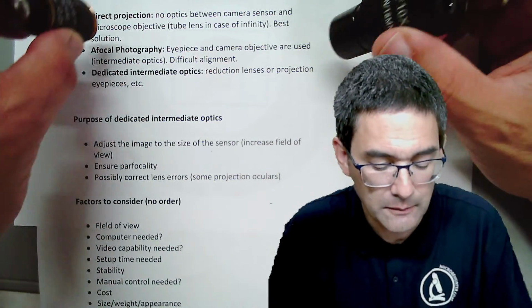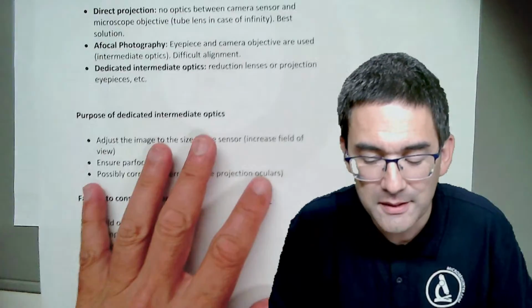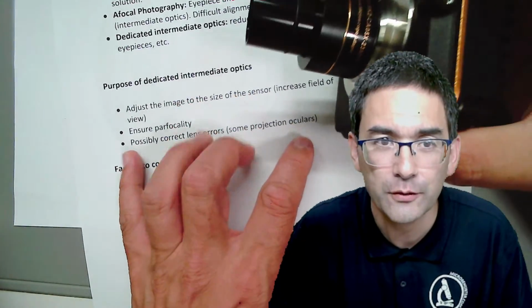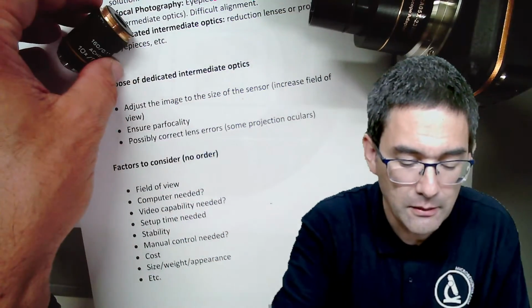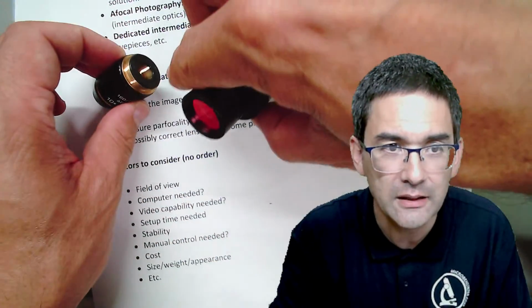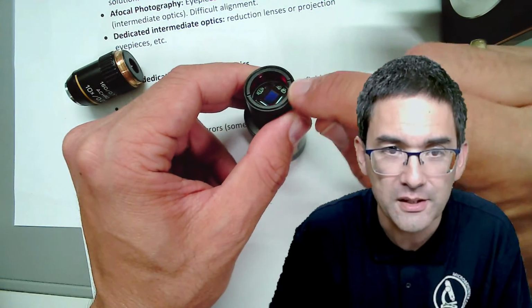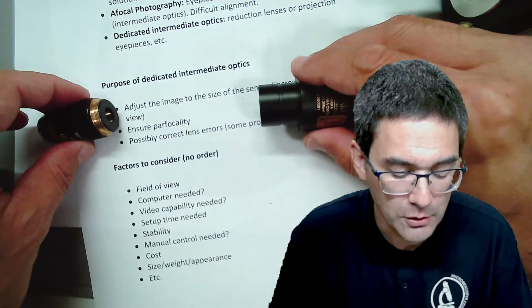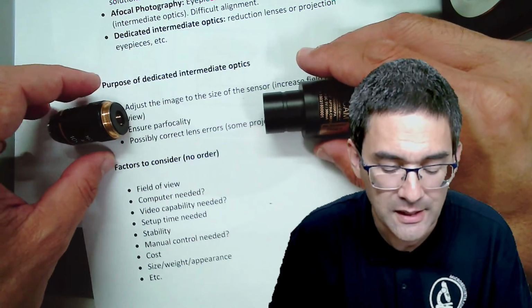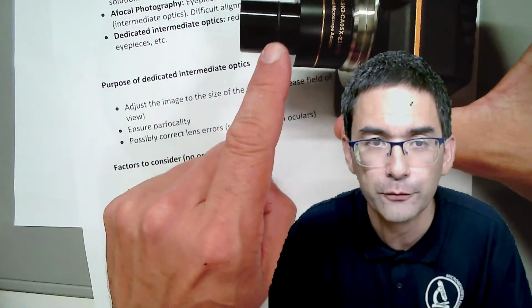And the question is now the following, and I'm basically also addressing questions that I've received over the years. Well, if it is possible already to directly project an image from the objective into a camera, and this one over here does not have any optics, it's just a glass sheet, but there are no lenses here. If this is already possible to do it directly like this, why do some cameras even have optics in front of it?